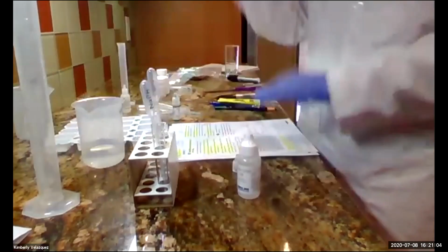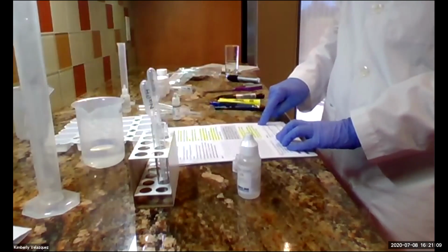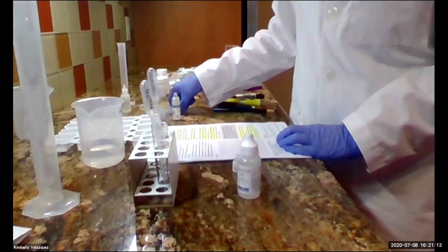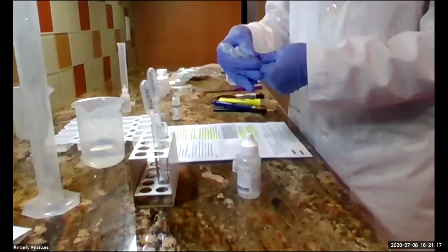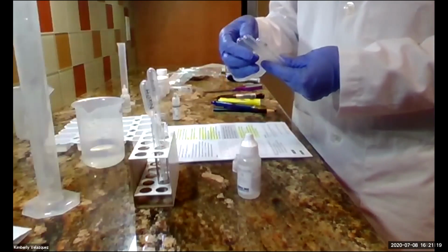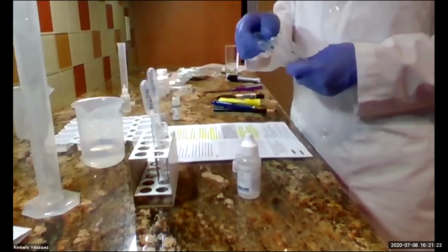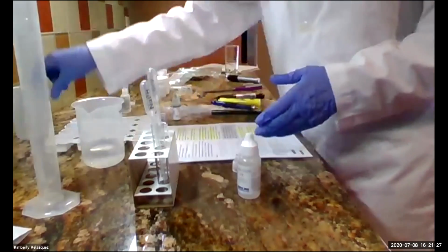Okay, so activity 2 is going to require you to label 3 test tubes and 3 more of these droppers. One of them, the water one, you're going to use again. You're going to label these pH 4, 6, and 8, and then you've got your water one. And you're also going to label 3 more test tubes.